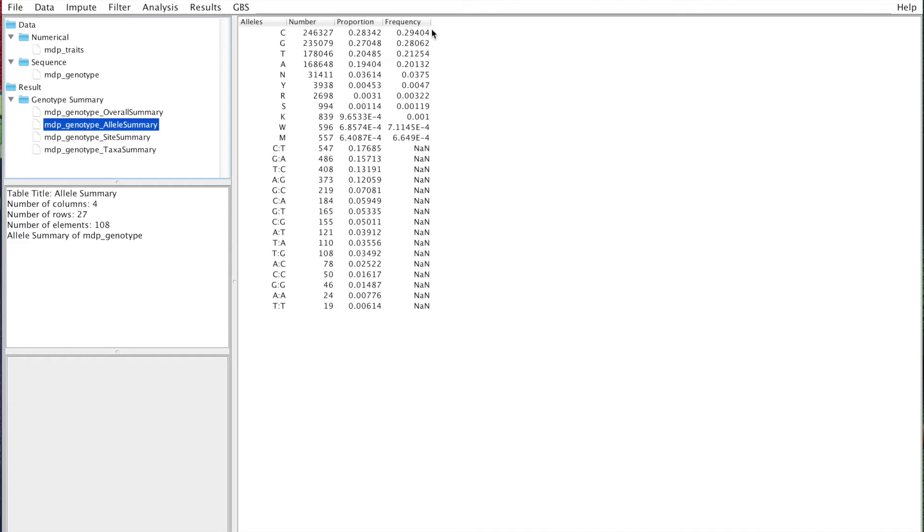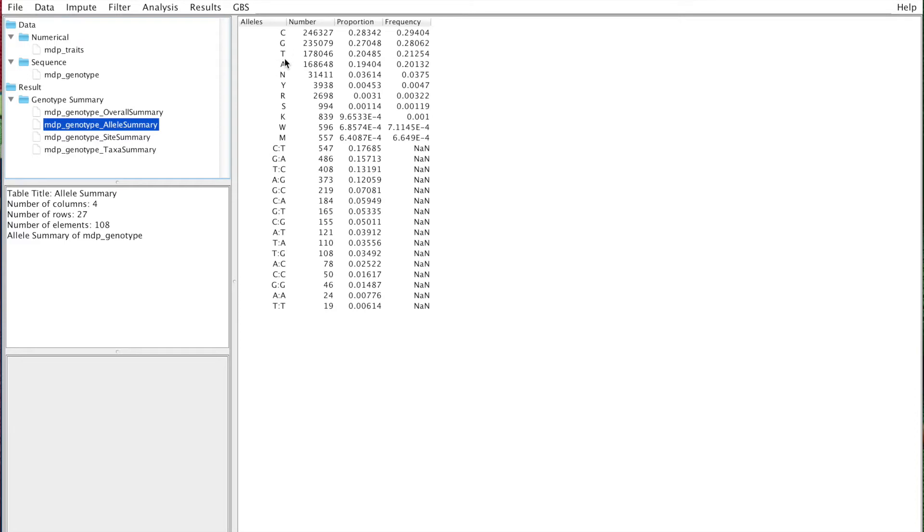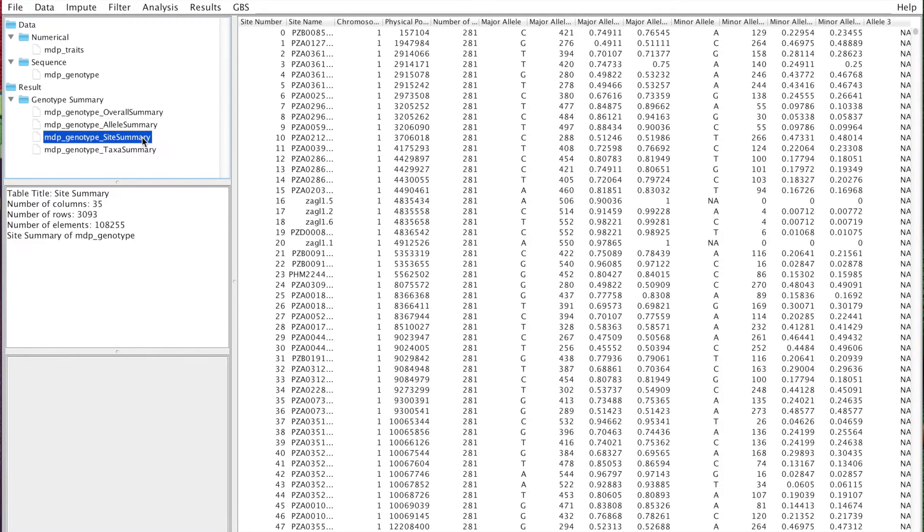Depending on sequencing technology, this may deviate from a similar proportion of CGTA, or the region of the genome you're targeting. But in general, you expect roughly the same amount of each nucleotide. High deviations may indicate some issues. You also have the number of Ns, number of missing data, and heterozygotes. In this case, heterozygosity is very low, which makes sense because we have inbred lines.